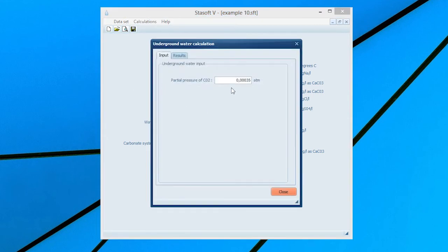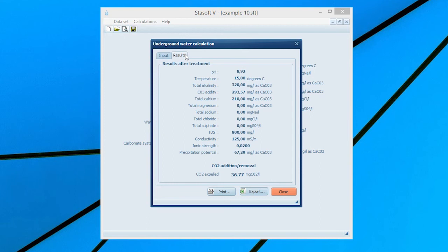Enter the partial pressure of carbon dioxide in the air by typing 0.00035 or accepting the default value into the Partial Pressure of Carbon Dioxide input box. Selection of the Results menu option will bring the Results After Treatment window onto the screen with values of the state of the water and the amount of carbon dioxide lost or gained by the water after equilibrium with the air has been attained.